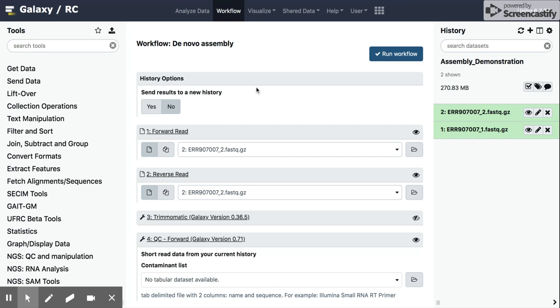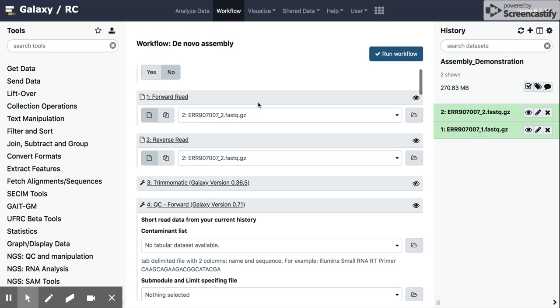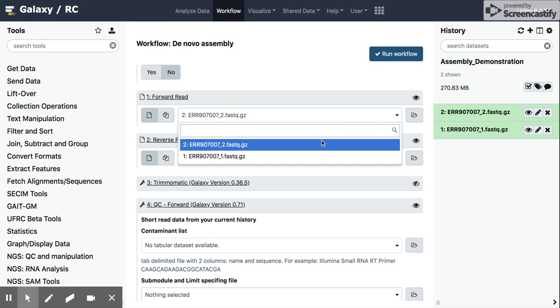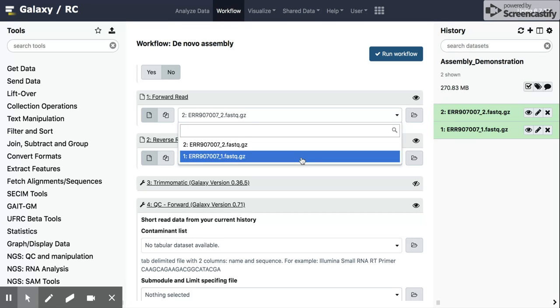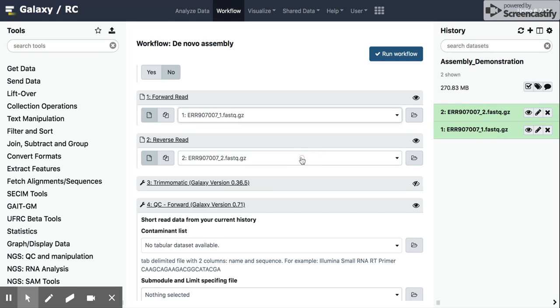And so we're going to go through this one at a time now. We have the input data sets, the forward and reverse reads. You're usually always going to have to change this to the appropriate input read. So the forward read should be the underscore one or R1 if you're using those data straight from the sequencer, underscore two for the reverse read.